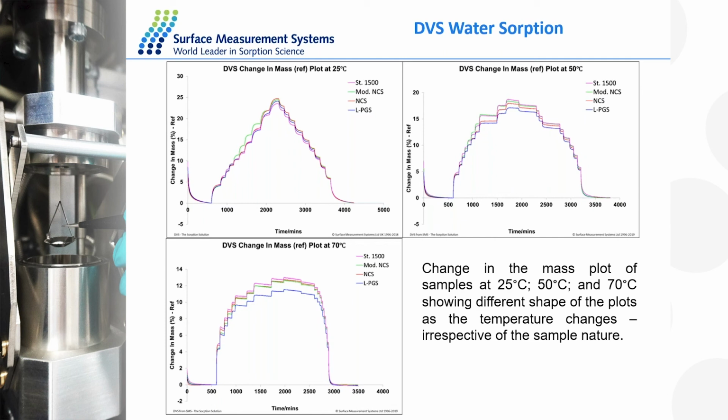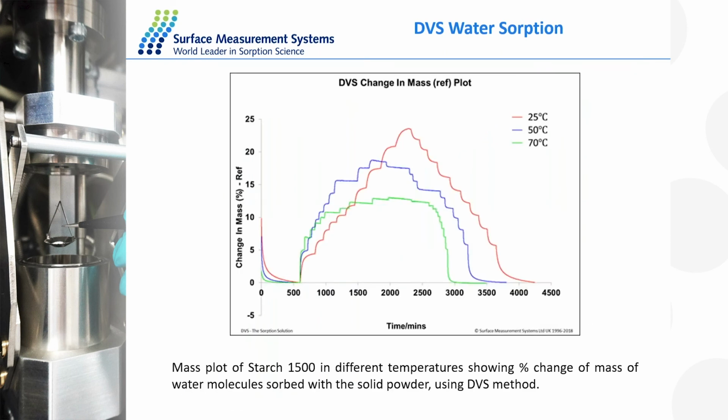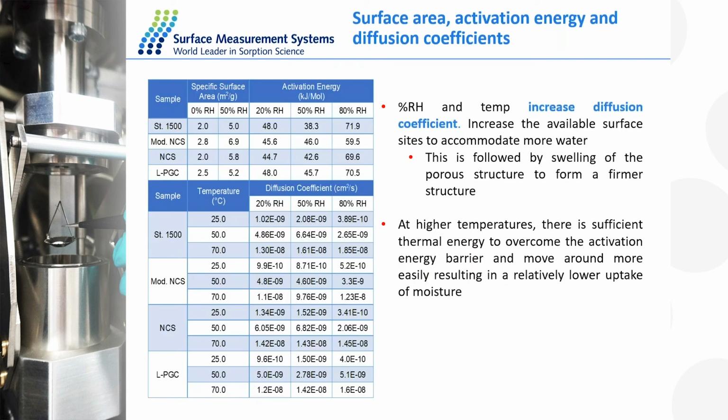Really nice presentation. But if you go back to one slide that you've shown, and further back, if I can ask you one more follow-up question, one more slide back, where you see, yeah. What do you analyze and what do you derive when you expose this sample to different humidity? Is that the diffusion coefficient of starch, which is different from any other sample?